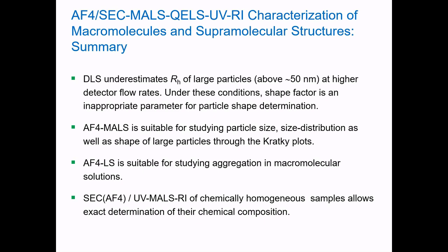We once again prove that AF4 coupled to light scattering detectors is a suitable method for studying aggregation in macromolecular solutions. In addition, a multi-detection system coupled either to size exclusion chromatography or asymmetrical flow field flow fractionation technique allows us to determine the exact chemical composition of chemically homogeneous samples.